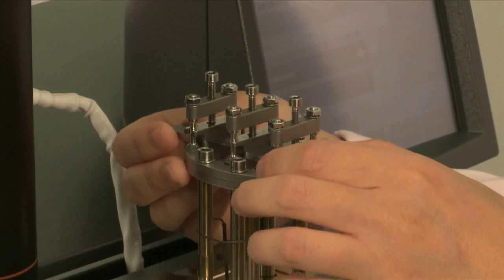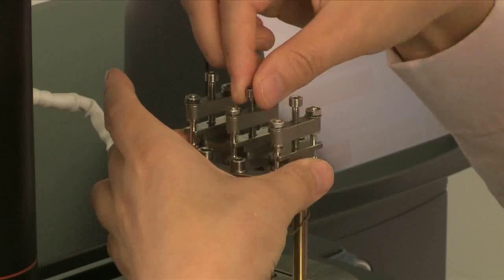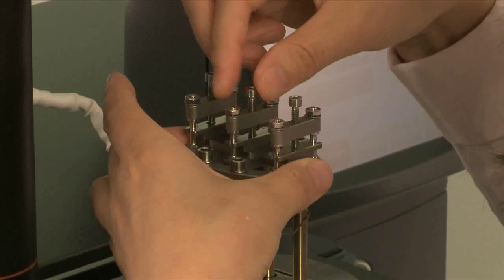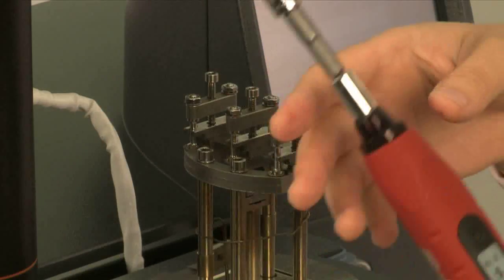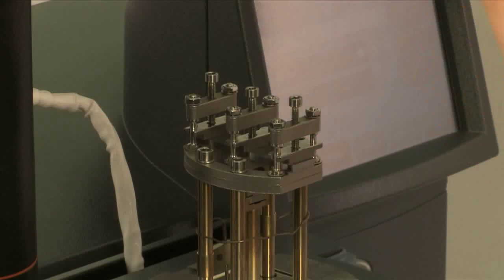Then, load this bar to the clamp. Use this torque wrench with a torque range of 8 to 10 inch pound to tighten the screws.